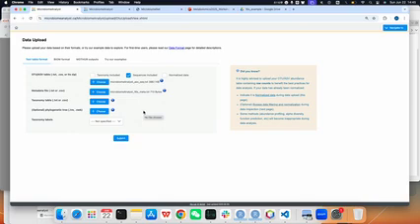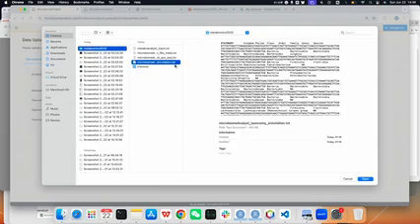And then the last is the taxonomy annotation. The most different thing about microbiome data compared with other omics is that it has 7 layers, different taxonomy levels. So we need to upload the taxonomy annotation. Here, the first column should be the ASV sequence.